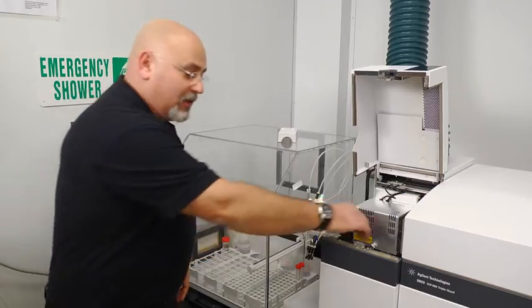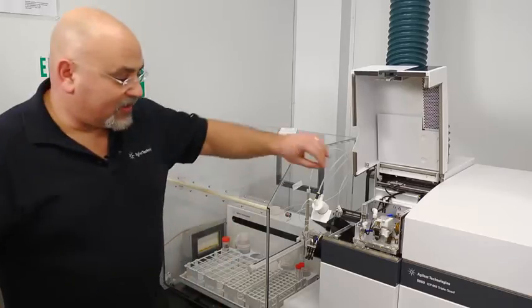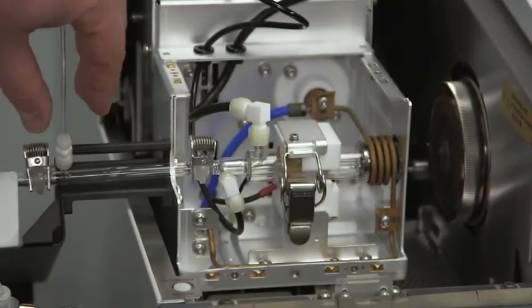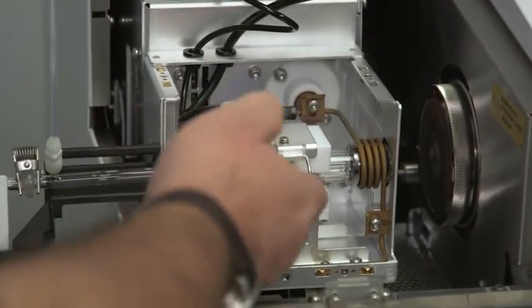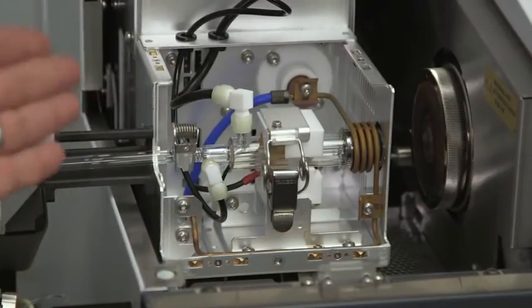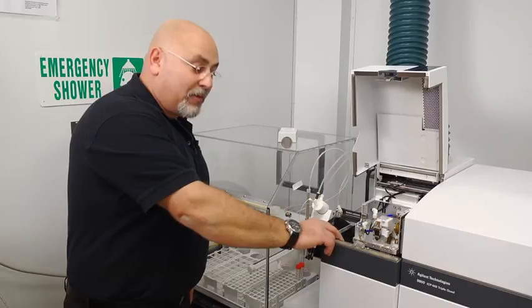I will now open the latch to show a closer look at the inside of the sample introduction. Right up front, we can see that we have the high matrix interface that would allow you to do aerosol dilutions, which is a high capability of any of the Agilent ICP-MSs. We are then looking at the torch, and we see the two gases: one is the plasma gas and the other is the auxiliary gas. Fairly simple, all really easy to dismount and mount back.